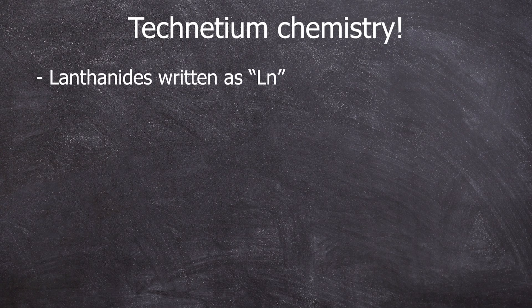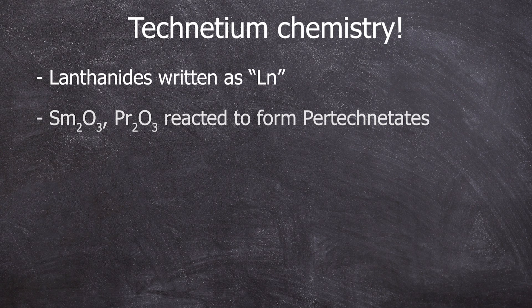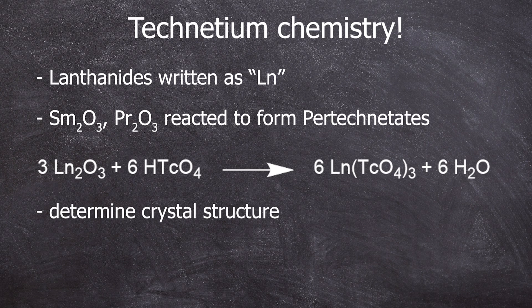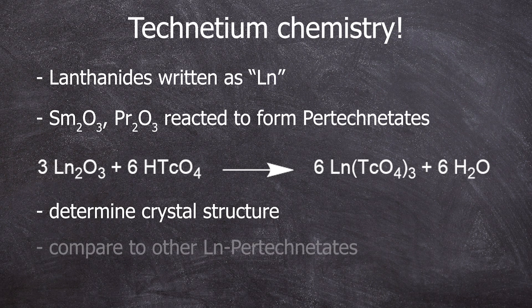What is going to be done in the video? The oxides of lanthanides samarium and praseodymium are reacted with pertechnic acid. In an acid-base reaction, the respective lanthanide pertechnetate and water will form. The crystal structure is then determined to compare it with other lanthanide pertechnetates.